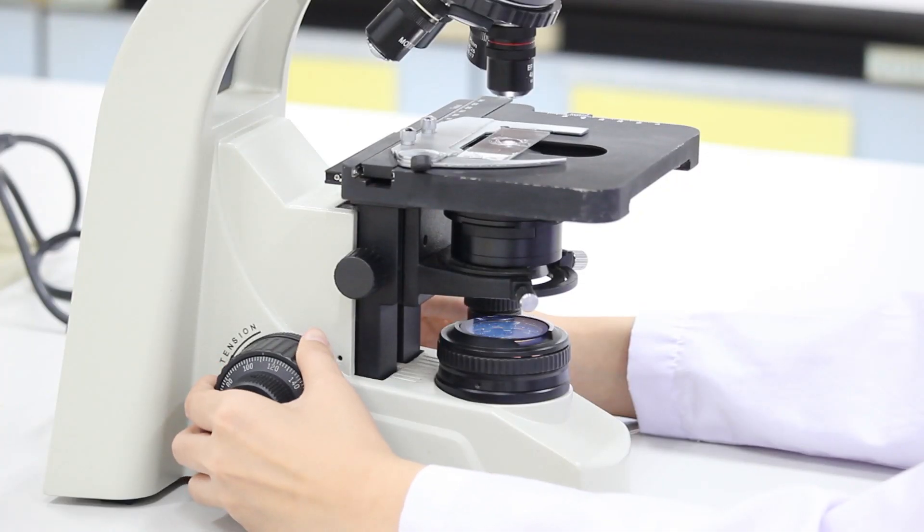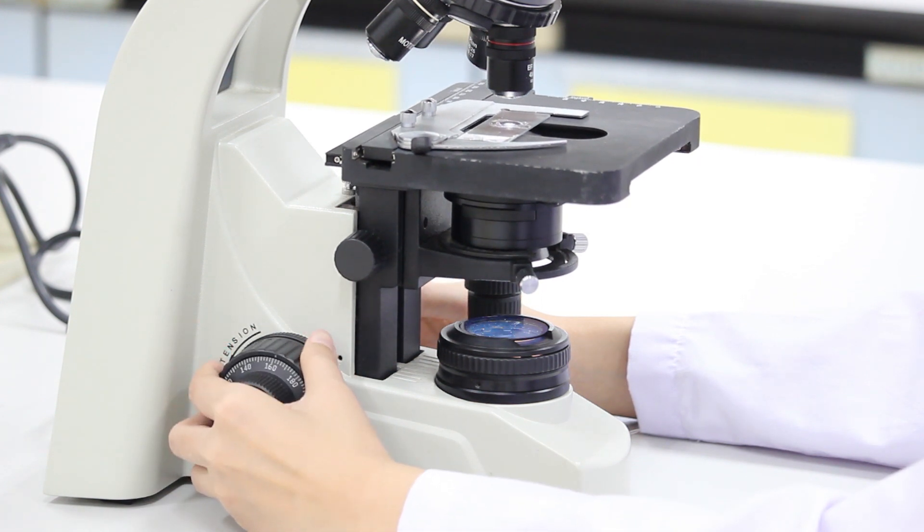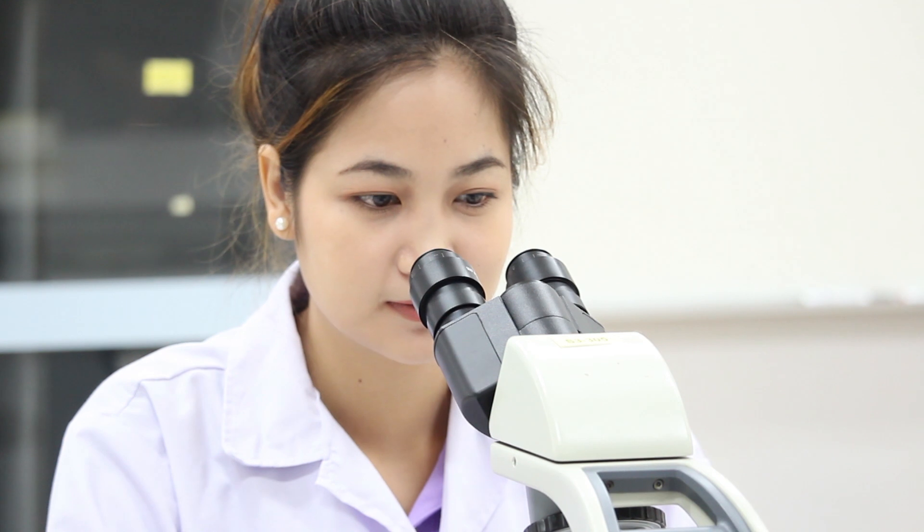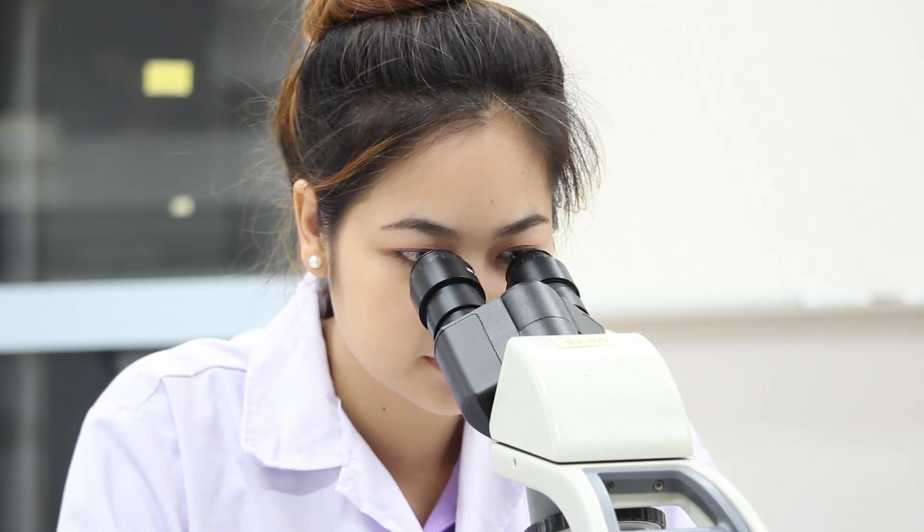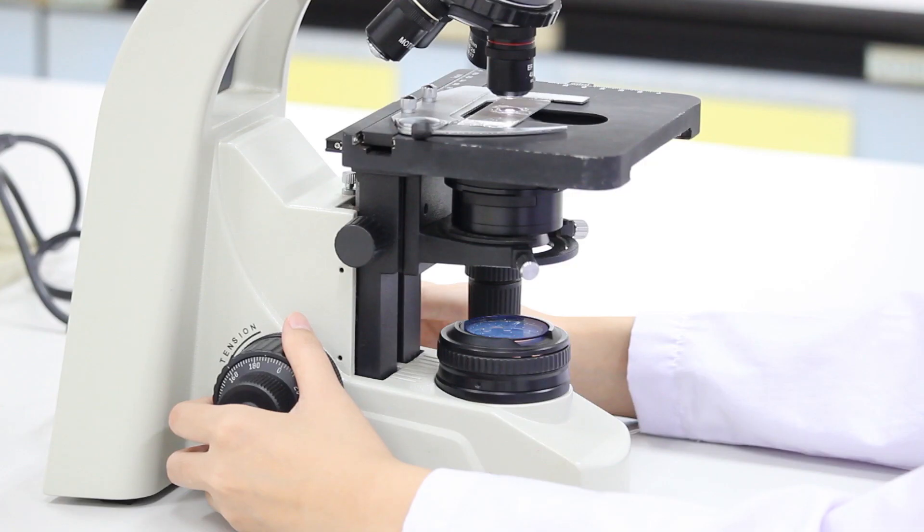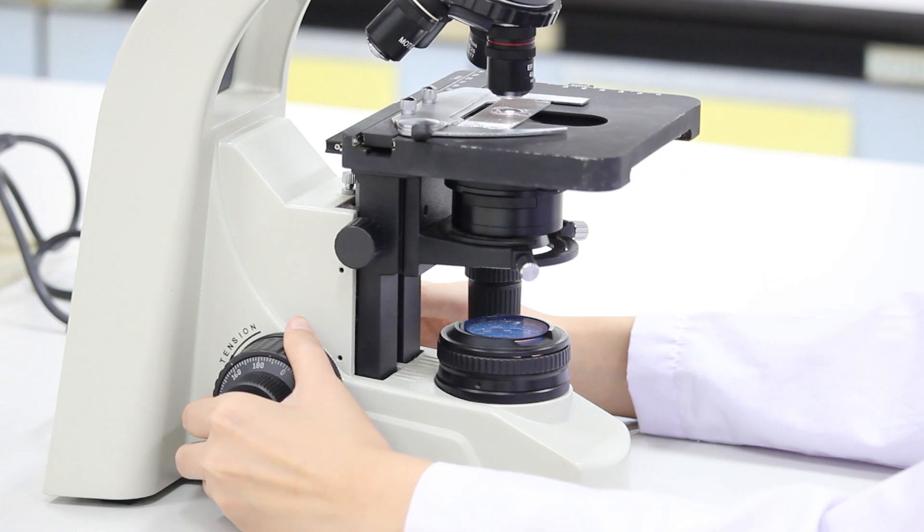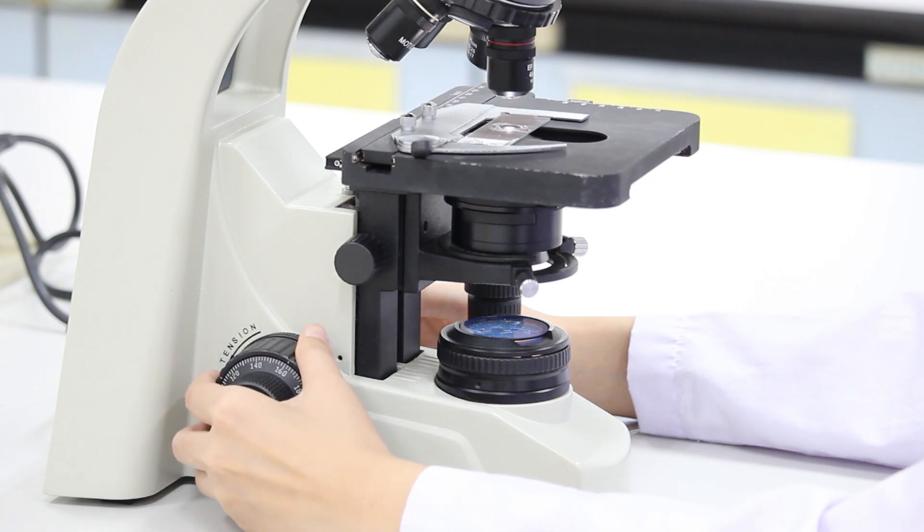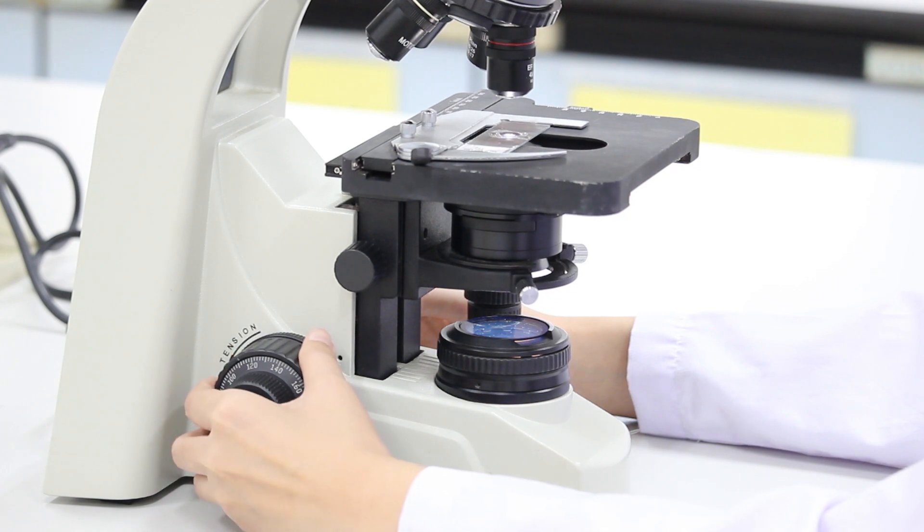Rotate the coarse adjustment knob to move the stage within 1 cm of the objective. Then, look through the eyepieces with both of your eyes open. Rotate the coarse adjustment knob to move down the stage until the image comes into focus.